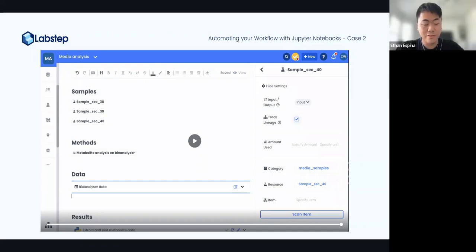Just before we move on though, Charlotte, I've got a question for you. Again, this sort of work isn't my forte, but I'm very interested in it. So how much Python do I need to know to use Jupyter Notebooks? And can I use any other languages for this?